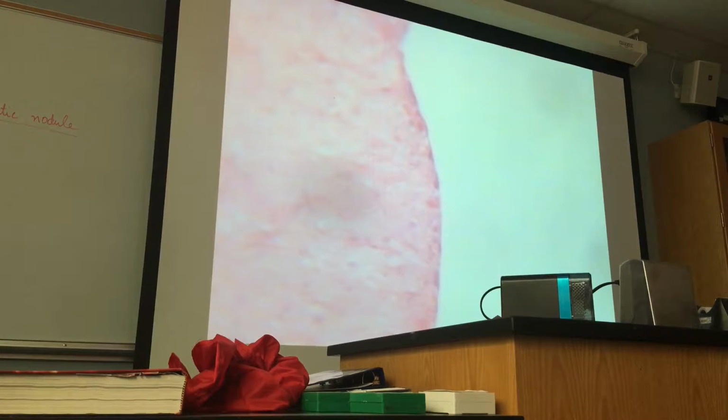There you go. It's highly magnified. It's about 800 or more times magnified, these cells. You can see the nucleus. Very thin areolar connective tissue, and these are the smooth muscle cells of the longitudinal layer. But I don't have to come to this magnification. Why is it called longitudinal? Because of the orientation of the muscle cells, longitudinal.